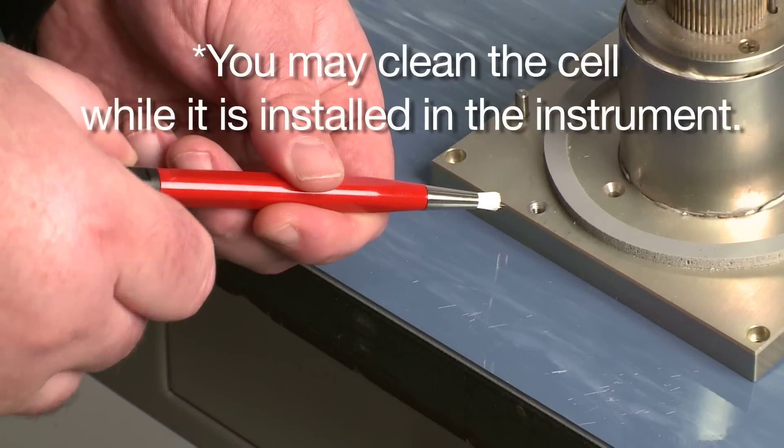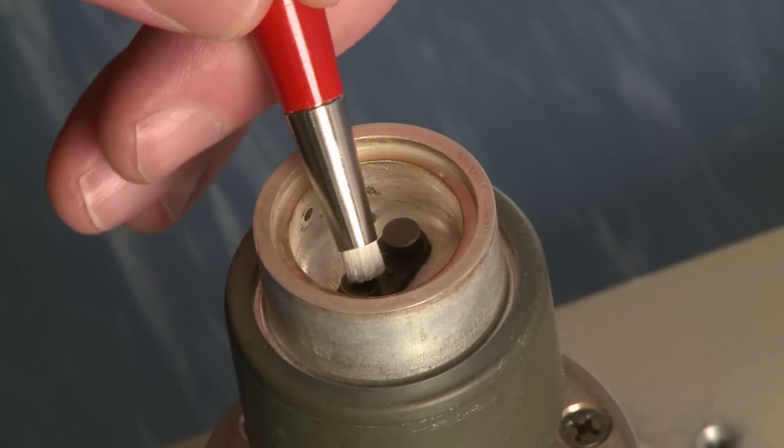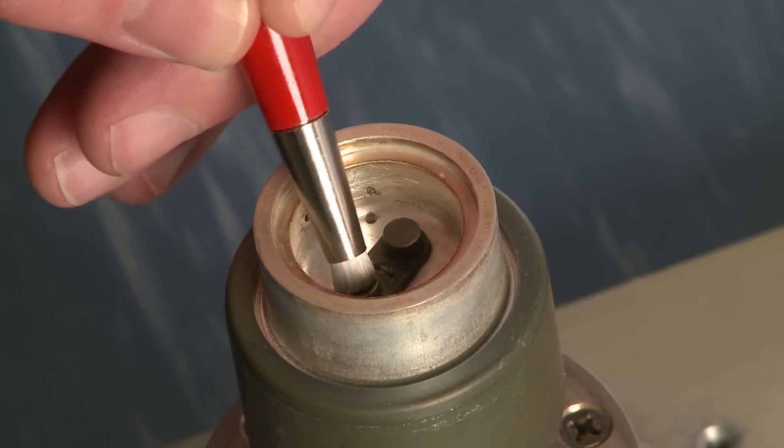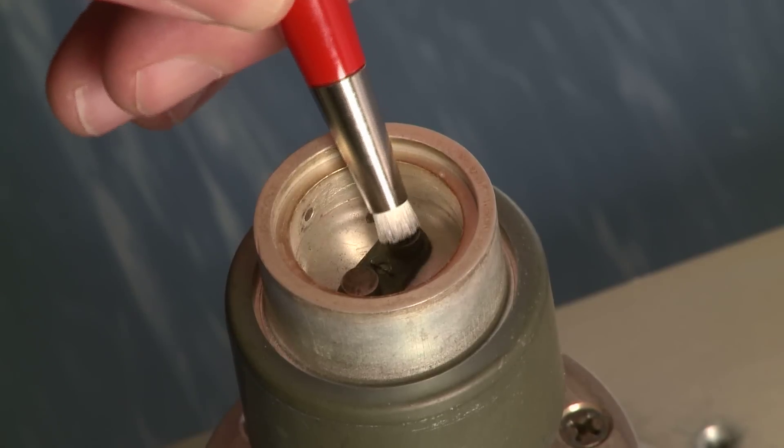Simply bring the bristles back in a little bit so you have about the length of a pencil eraser, and then using the motion of a pencil eraser, polish the cell sensors.